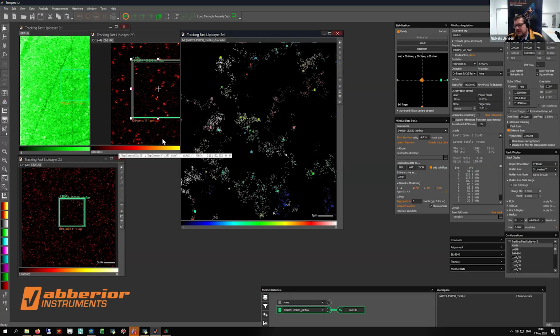When we start this localization, we always have quality control checks. Do we really have a single molecule? We can define this by analyzing the pattern that we have. And if we have a single molecule, we track this single molecule as long as we can, till it's bleached or going to a dark state. As I said, the speed is about 100 microseconds.